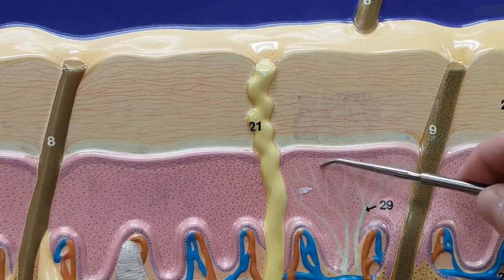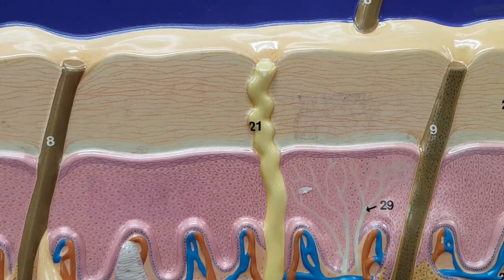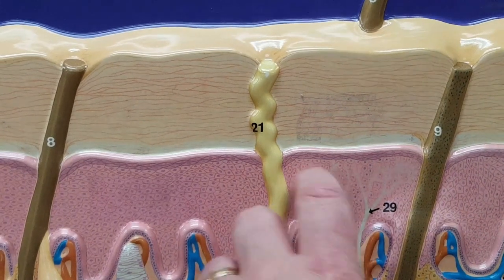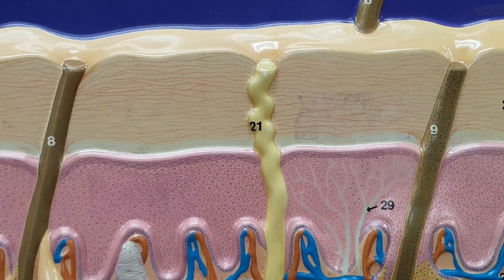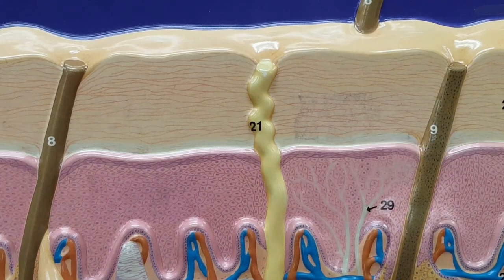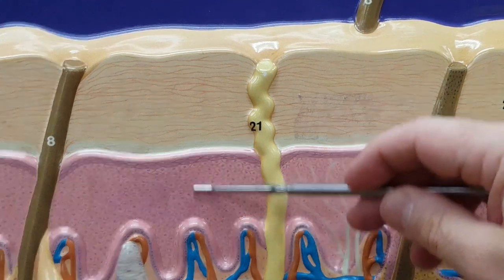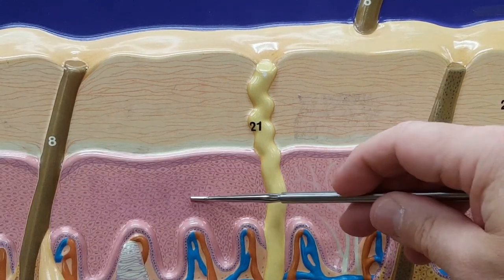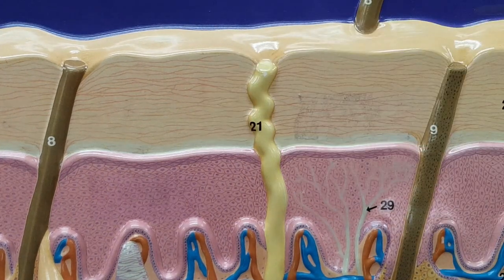This whole pink region that I see here, and I can tell a little scrap of a label, somebody this semester asked this as a quiz question. Maybe I will too, I don't know. This layer right here, second one up, the stratum spinosum. It's going to be a number of layers of cells, not just one. So the basale is one layer. Spinosum is right here. Those are the first 2 strata going up in your epidermis.